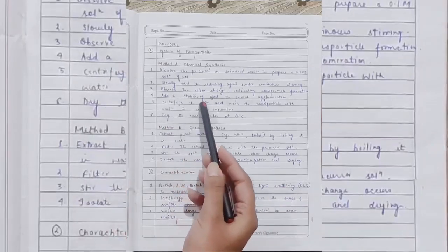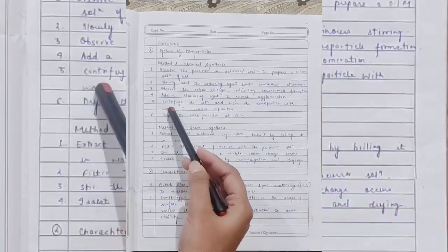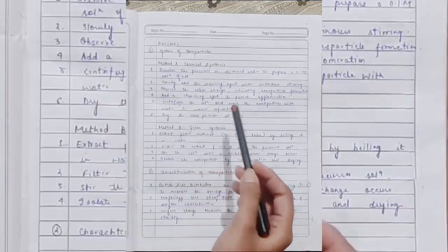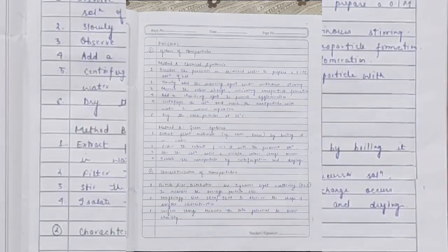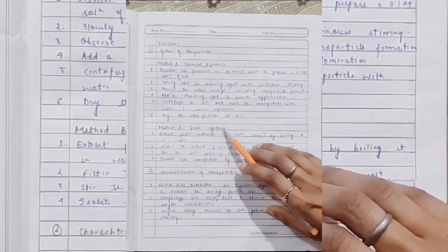Next, add a stabilizing agent to prevent agglomeration, and moving ahead we have to centrifuge the solution and wash the nanoparticles with water to remove any impurities present, and at last we will be drying the nanoparticles at 60 degrees Celsius.